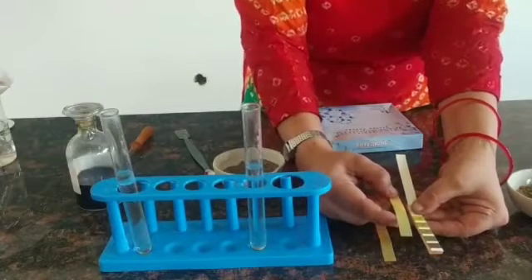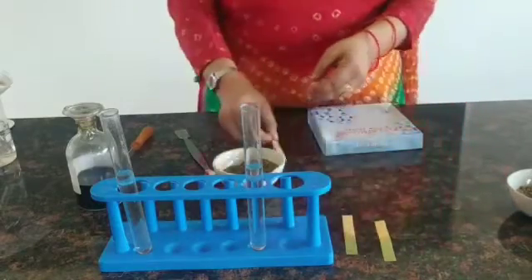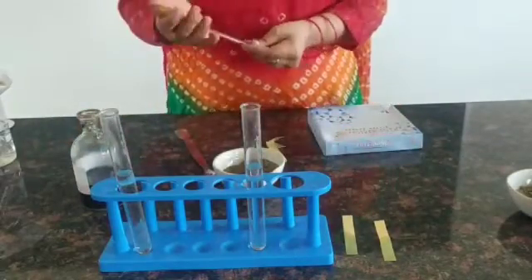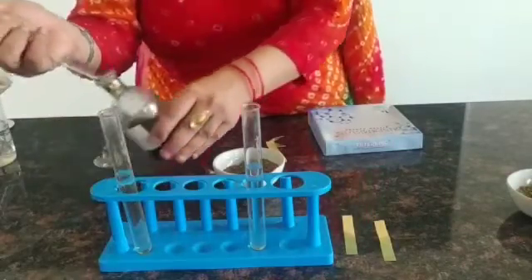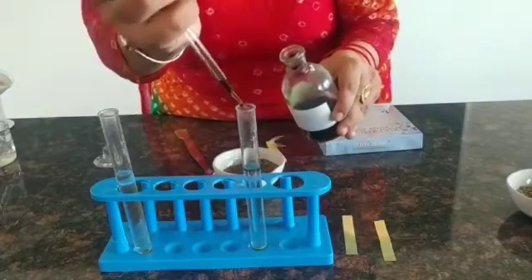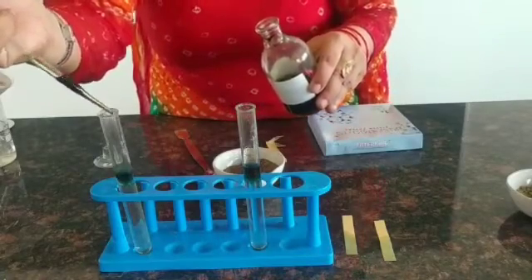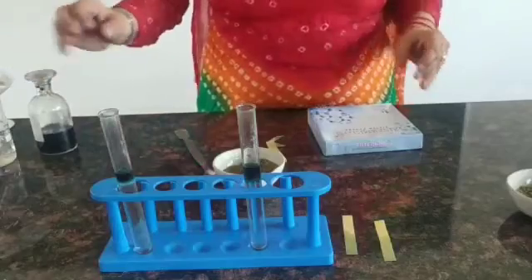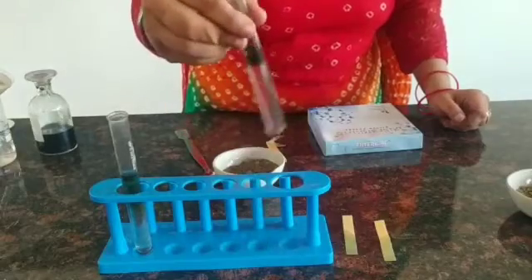For this method, we'll take the universal indicator in a dropper and put two to three drops of it in both the test tubes. This is the first test tube containing the garden side soil, and we'll also place the universal indicator in the second test tube containing the roadside soil. We'll leave it for some time, then observe the color change and note down our observations.